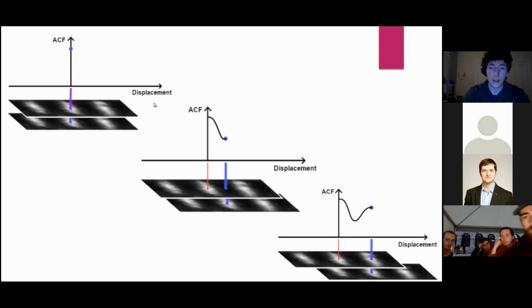So then what do we do? Okay, so we take out patches of exactly this size. This size is called the kernel, or the kernel size. But we notice that for an image which is roughly 1,000 by 1,000 pixels, if you take out a patch at every pixel, and each one of those patches has, say, 15 by 15 pixels in them, or it could even be 30 by 30 pixels, the amount of memory you require to process all that data blows up. It gets so big that it doesn't fit inside the RAM of any standard computer at the microscope, and we don't want to have to use supercomputers or anything like that.